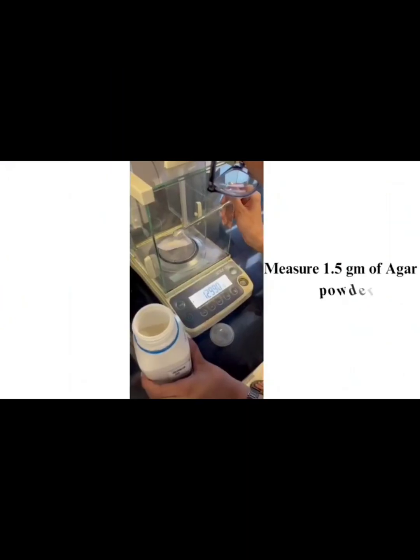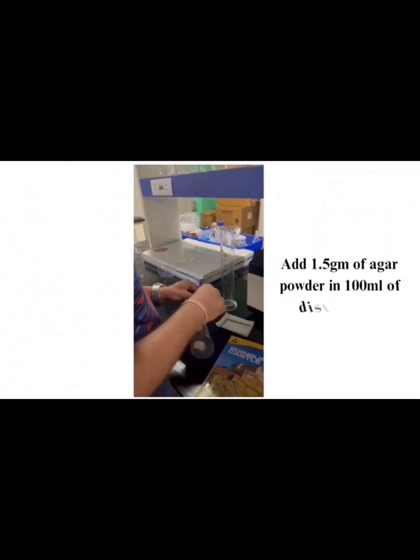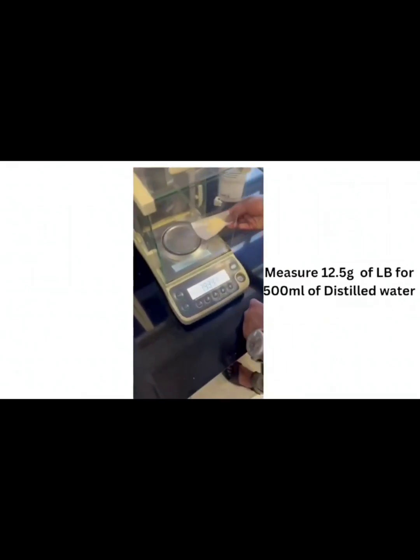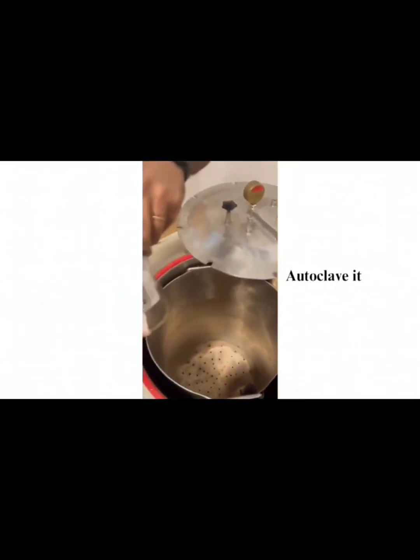Measure 1.5 gram of agar powder. Add 1.5 gram of agar powder to 100 ml of distilled water. Measure 12.5 gram of LB for 500 ml of distilled water. Mix and stir it well. Add 400 ml of LB to 6 gram of agar. Add 100 ml of LB to 1.5 gram of agar and autoclave it. Later, pour the media on a petri plate and allow it to solidify.